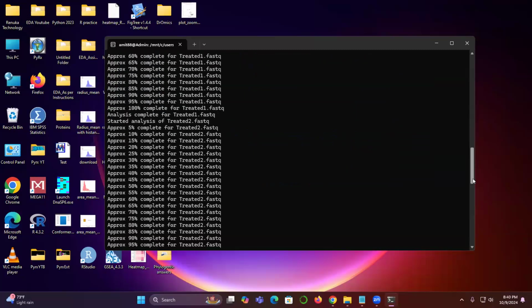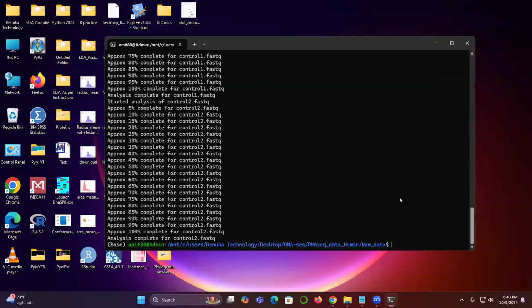Ma'am, I have not followed you. Can you please repeat? Even when I open my Ubuntu, it is not opening. I don't have the WSL. Just share your screen. Okay. Should I stop now? Yeah.